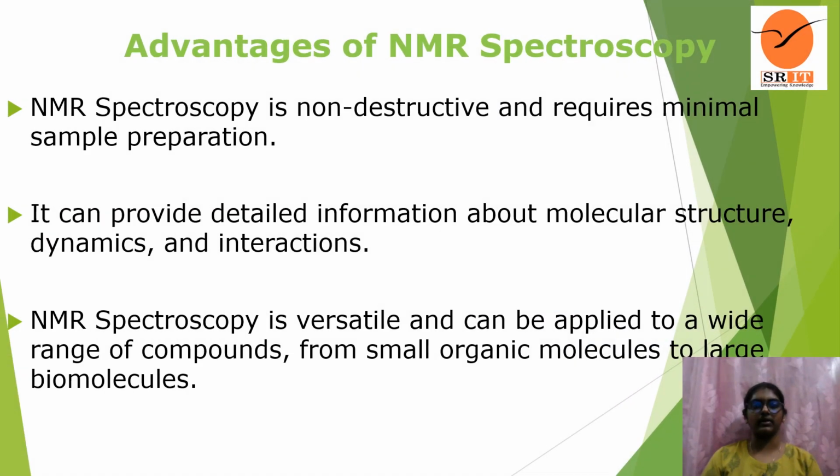Advantages of NMR spectroscopy. NMR spectroscopy is non-destructive and requires minimal sample preparation. It can provide detailed information about molecular structure, dynamics, and interactions. NMR spectroscopy is versatile and can be applied to a wide range of compounds, from small organic molecules to large biomolecules.